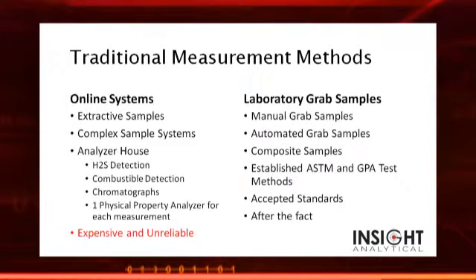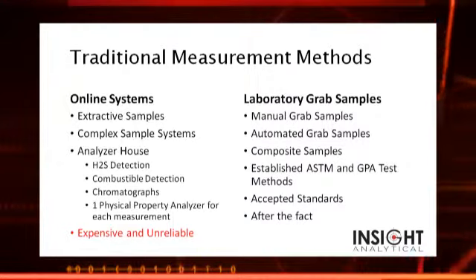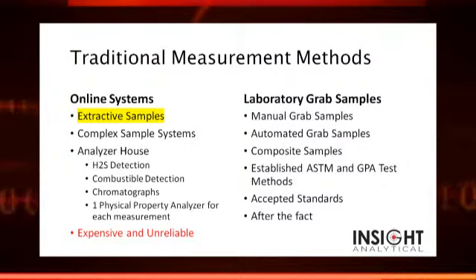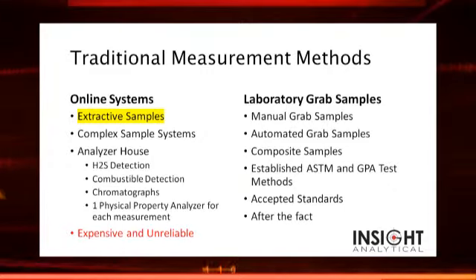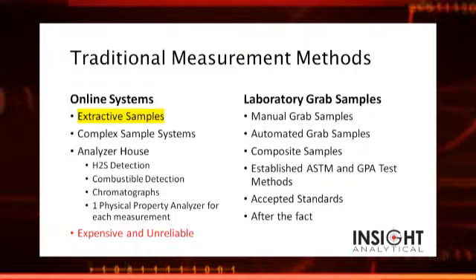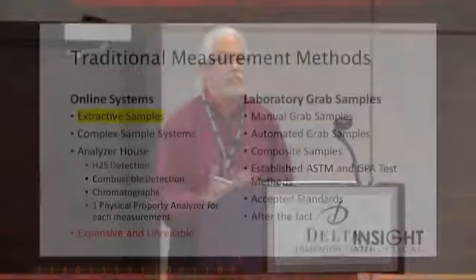By extractive, I just want to highlight a couple of things here. What we mean is that we're taking the sample out of the process, bringing it over to an analyzer building to do the analysis, and then having to consider, how do I dispose of this sample? What am I going to do with it after I've done the analysis? I may now have to have a solvent recovery tank, or a recovery tank. I'm going to need a pump to put it back in the process. So I'm going to consider not just how am I going to do the analysis, but what am I going to do with the product after I've analyzed it?